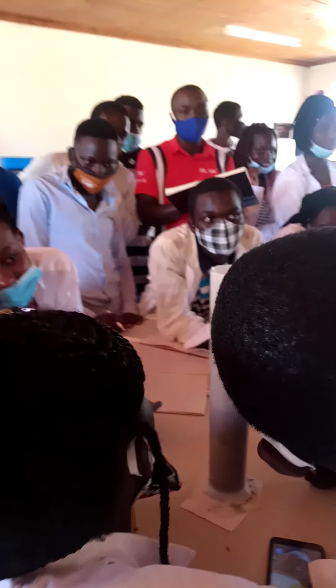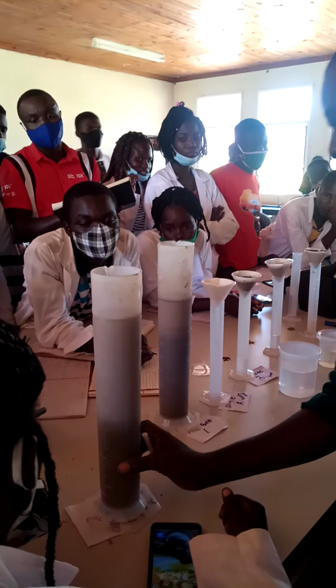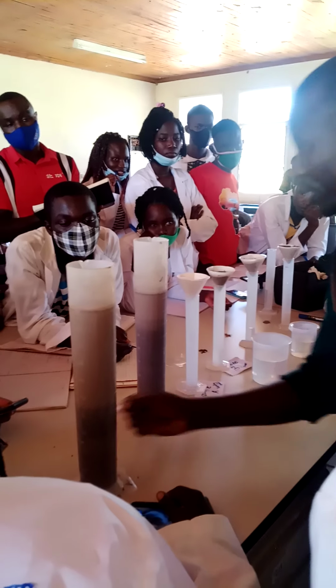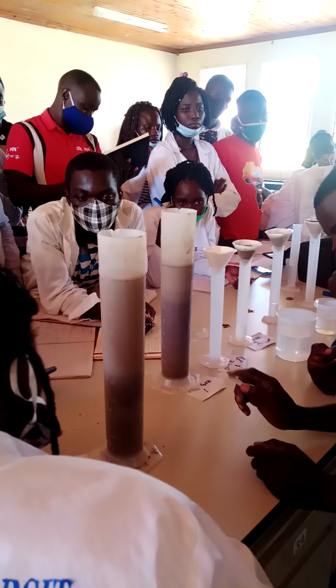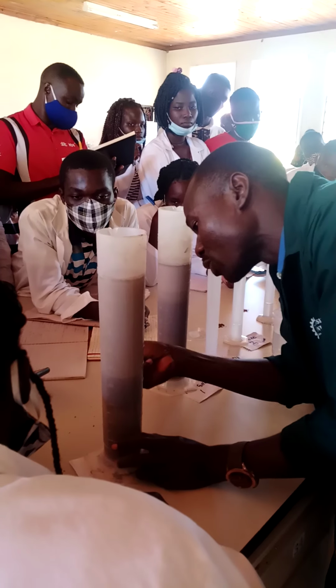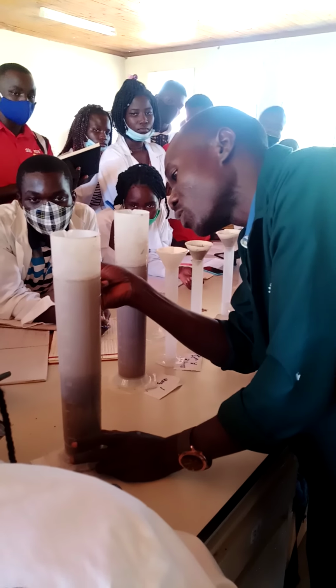You have to subtract. Now, this is how you count this thing. From here up to here, we counted it as 210 or 220. Now, when you're counting, don't you ever shake it. When you're counting the next thing, you start from where you stopped and count only that one. Then also count from here up to here.